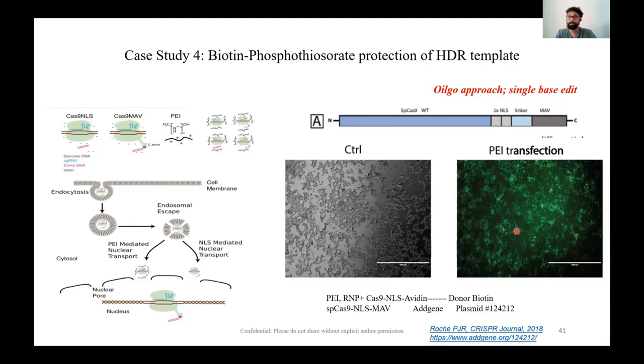But for immortalized cells, if you have budget issues, please give PEI a shot. It acts like FuGENE or jetPRIME, right? It's a version based on a liposome complex. So I would recommend using it if off-target is not an issue and if you're working on immortalized cells.